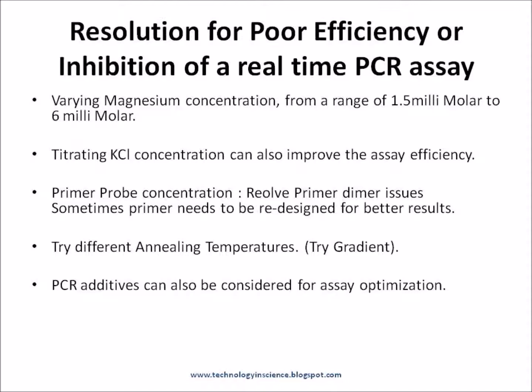Titrating KCl concentration can also improve assay efficiency. Primer and probe concentration optimization plays a major role, and primer dimer issues need to be resolved for better efficiency, specificity, and sensitivity. Sometimes primers need to be redesigned for better results. Thermal cycling optimization also plays a major role and should be adjusted based on the Tm values of the primers. PCR additives can also be considered for assay optimization.